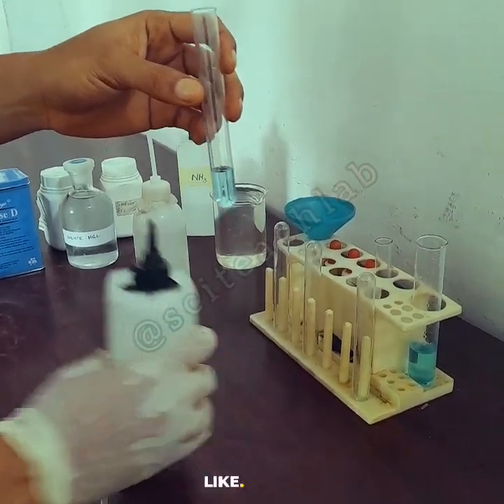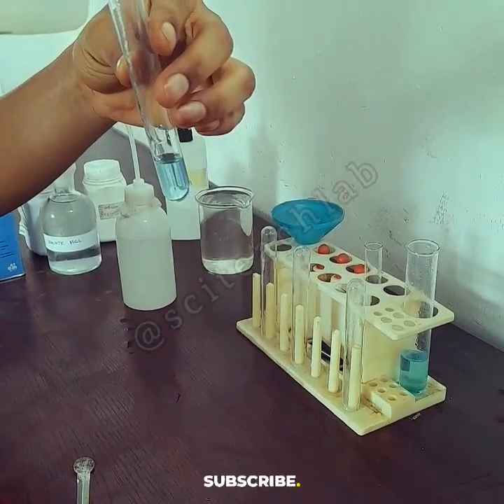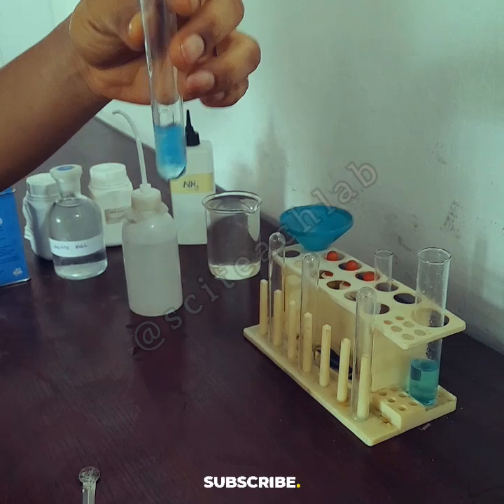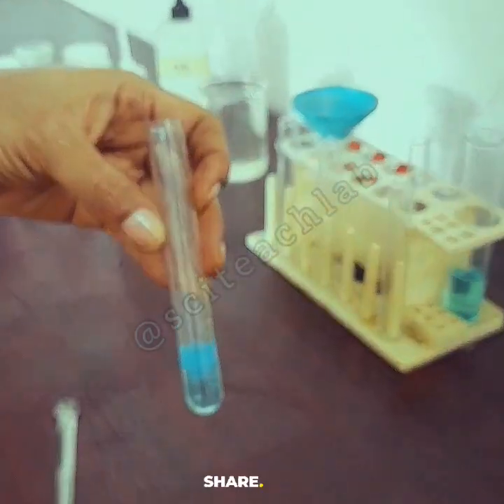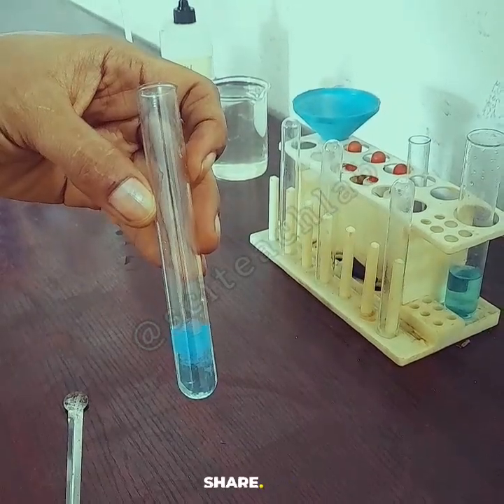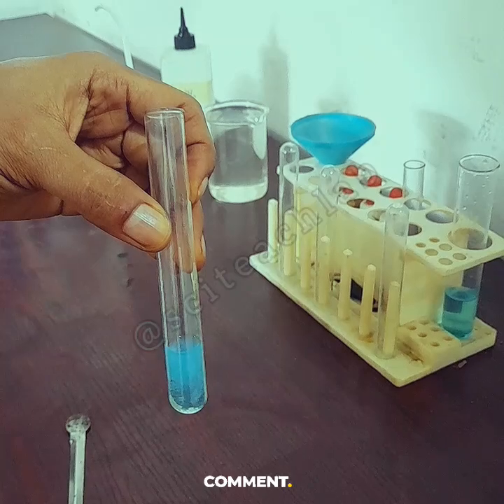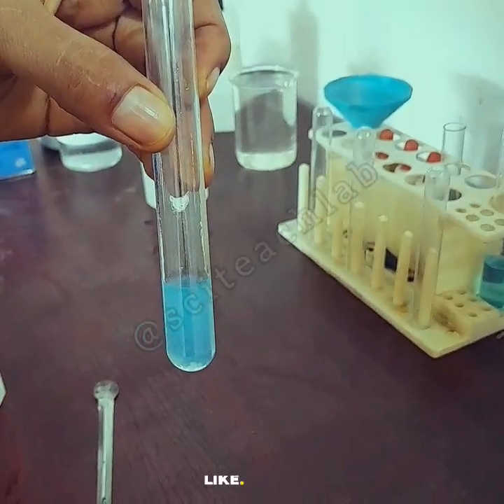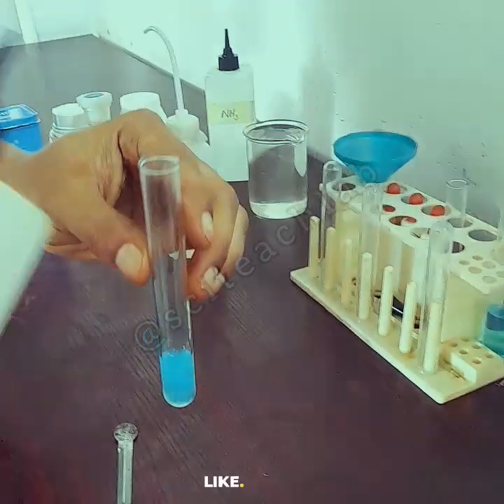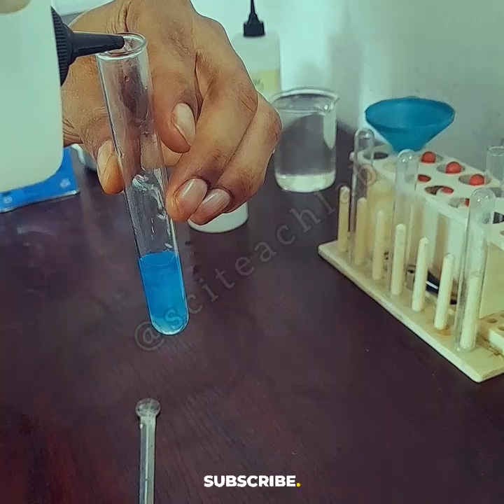The first test is with sodium hydroxide. I'll add sodium hydroxide in drops to this solution of C. I add 2 or 3 drops, and you see what forms. A blue precipitate is formed. Precipitates are those things that will not dissolve, but this one is gelatinous. It's not cloudy, but it's like a gel. So I say a blue gelatinous precipitate is formed.